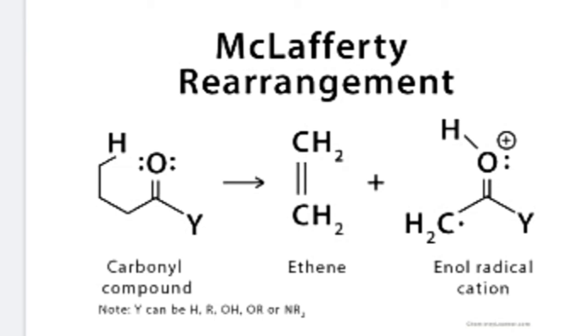We can explain the McLafferty rearrangement by the alpha, beta and gamma bonds.